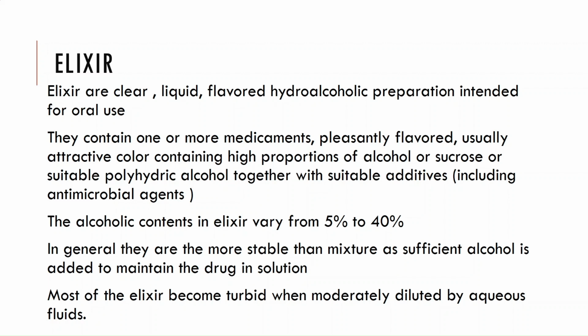Okay, so elixirs, I need to give you some hint on what elixirs are. We just went without the theory. I think people were wondering what are elixirs. In case you were wondering what it is, elixirs are clear, liquid, flavored, alcoholic or hydroalcoholic preparations intended for oral use. They contain one or more medicaments. The one we have looked at only contains one medicament.